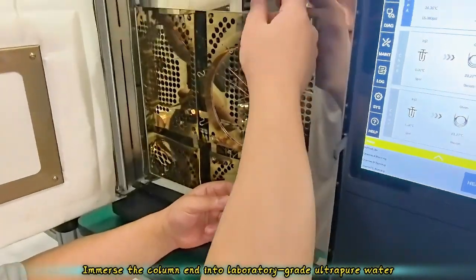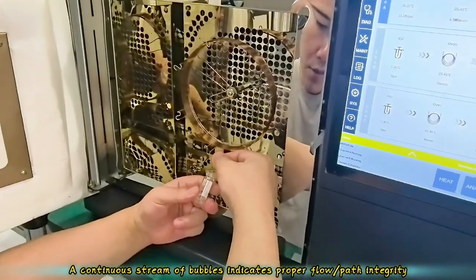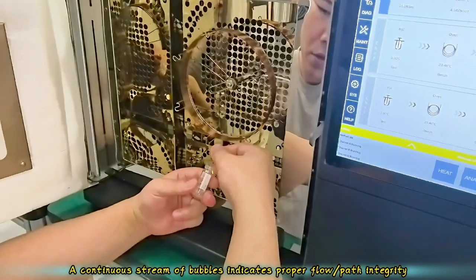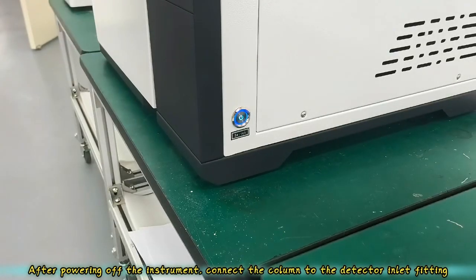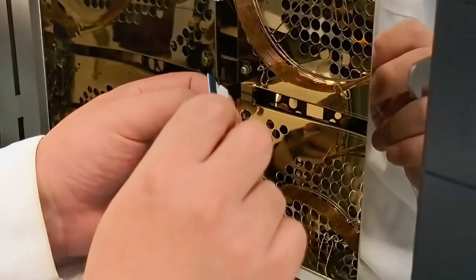Immerse the column end into laboratory-grade ultra-pure water. A continuous stream of bubbles indicates proper flow path integrity. After powering off the instrument, connect the column to the detector inlet fitting.